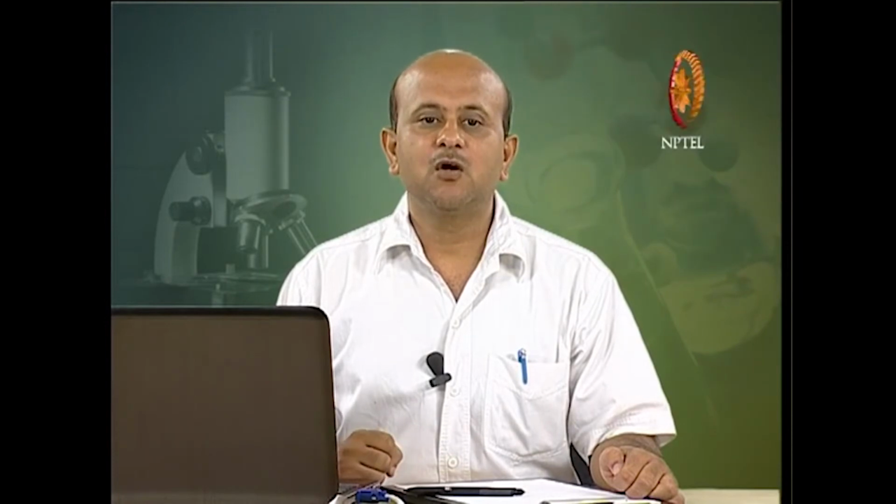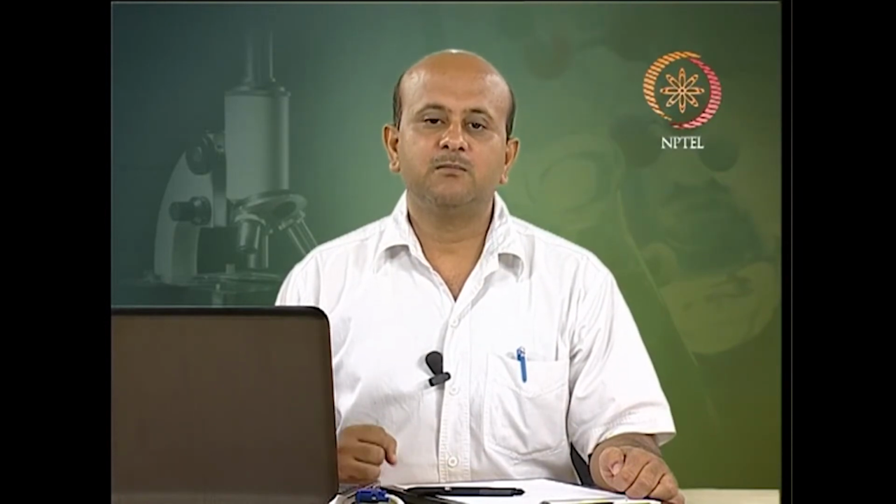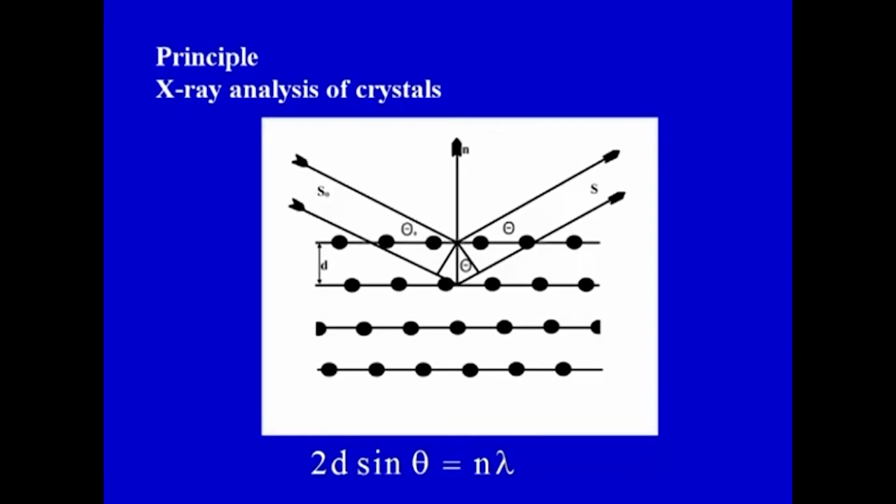The basic principle on which X-ray analysis or X-ray crystallography works is Bragg's law. If we consider the crystal here, the molecules, or you can say atoms, are arranged in different planes. These are the diffraction planes, and this is the distance between the two diffracting planes.